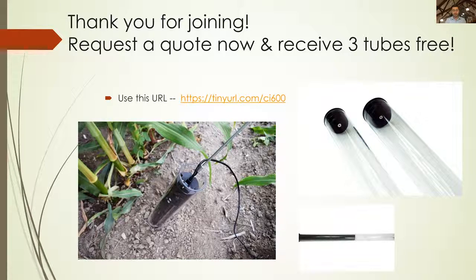Again, the next question is, do we need to calibrate on various DPI? And the answer is yes. If you're changing the DPI, you do want to calibrate again. But it's just as simple as pulling it back out, knowing where you had the depth before just by using the links of the rod, putting it into the calibration tube, scanning, calibrating, and then pulling it out, putting it in for the resolution you're looking for.